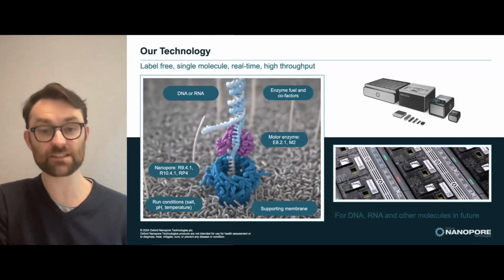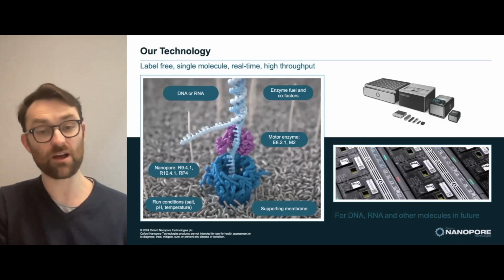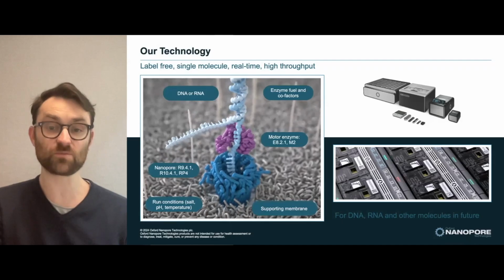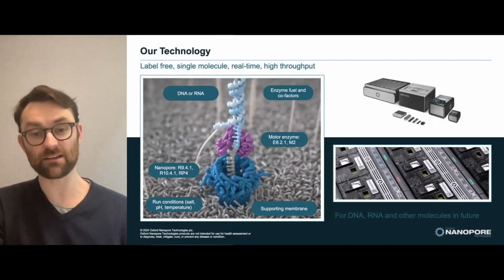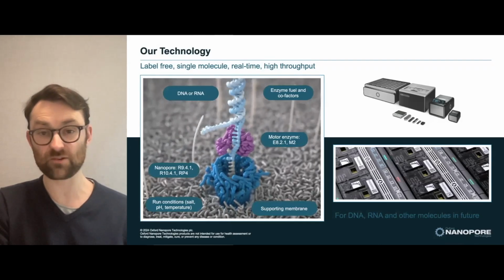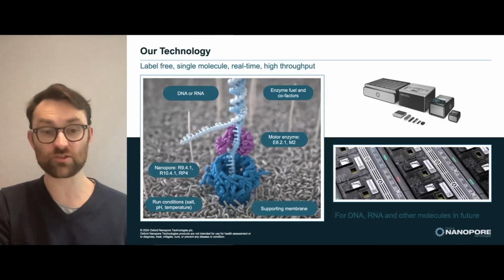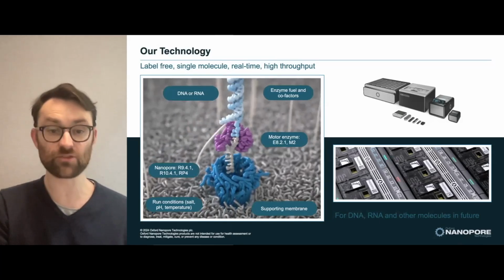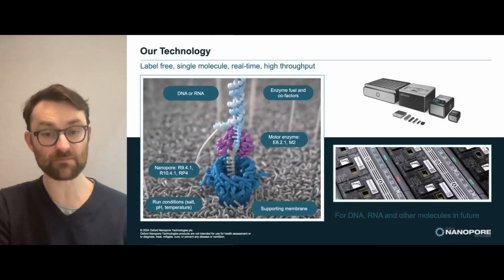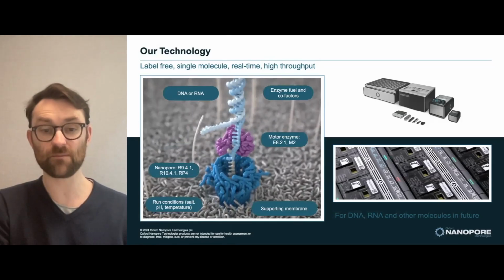And there's an electric signal applied on the flow cell, and as the DNA moves through the pore, the electric signal is disrupted. And this disruption in signal is then turned into A, T, G, C, into DNA bases. This process is called base calling. Because we just measure an electric signal, there's no laser, no optics. This method is basically happening in real time, so as the DNA goes through the pore, you can detect the sequence and base call it.